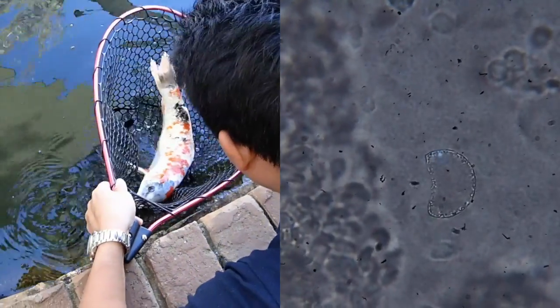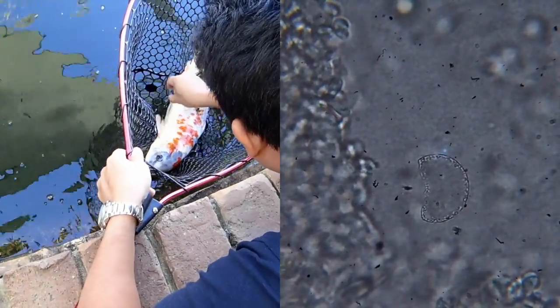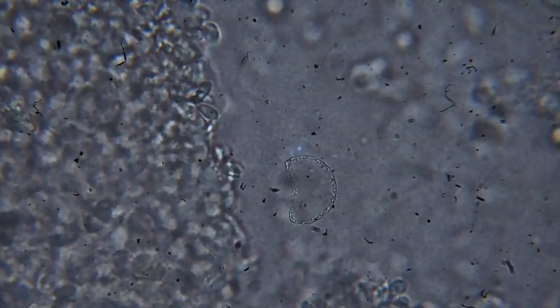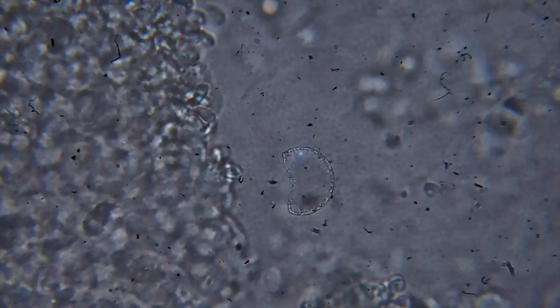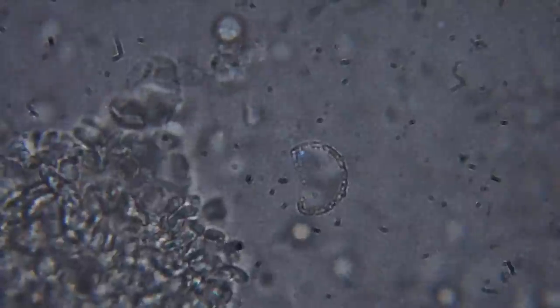This is a video of Kostia from a skin scrape of a koi, viewed at 400x magnification — using the 40x objective and a 10x eyepiece lens. On the left are the host cells, and all the things buzzing around are the flagellated protozoa known as Kostia.